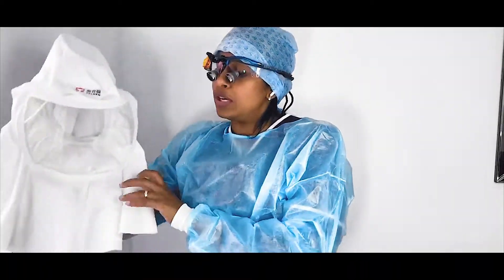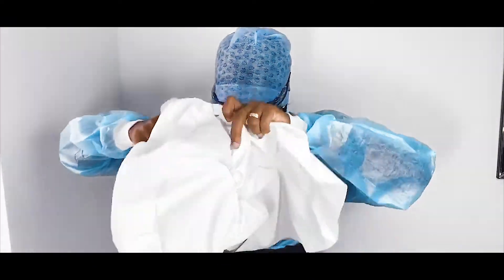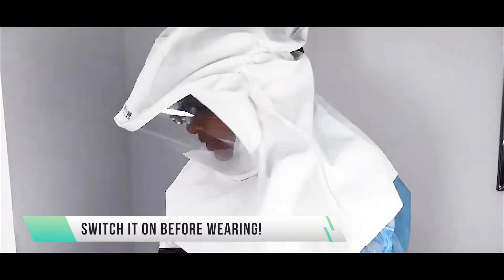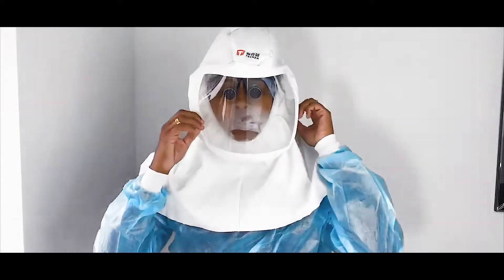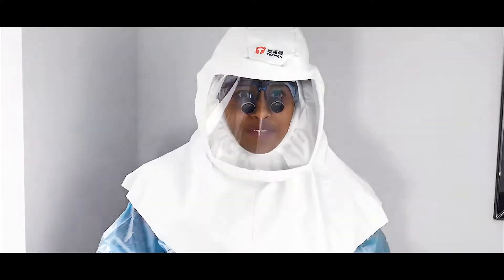You put the unit around you — you can adjust it, I've pre-adjusted it to fit me — and tighten it accordingly. Then the hood is already connected and it comes over your shoulder and goes right on top. I was supposed to switch it on first, which I didn't, so you can see it's getting fogged up.